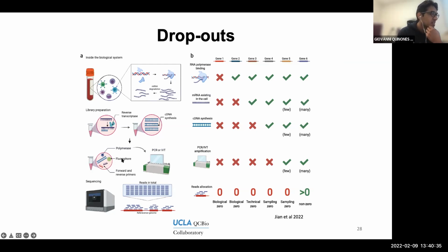If you look at this diagram, you'll have your cDNA molecule, and you're also going to have some primers that are needed for PCR. These primers will bind your DNA molecule, and once they are bound, they offer a template so the polymerase can start making copies. One potential artifact or issue is that the primers never bind your DNA.